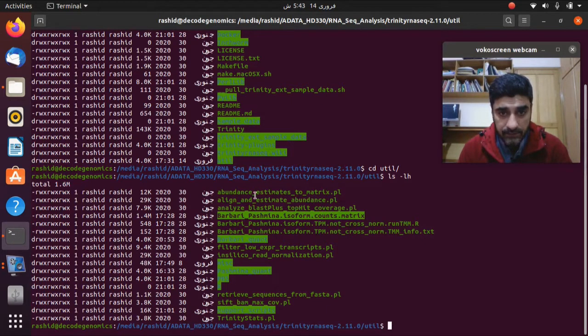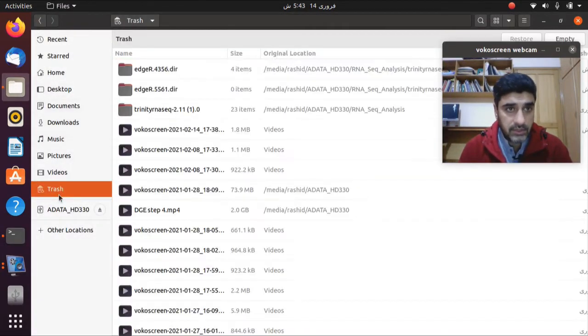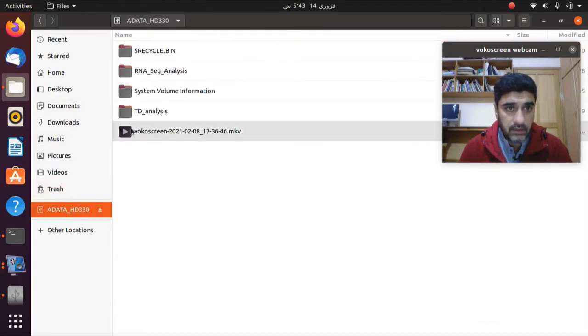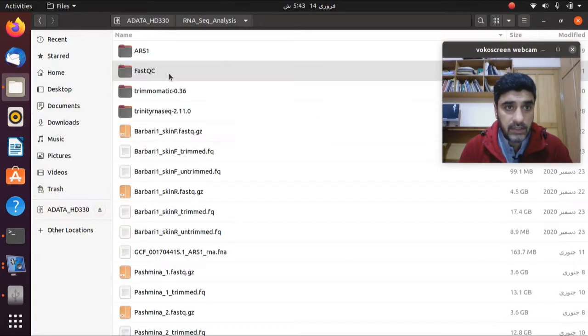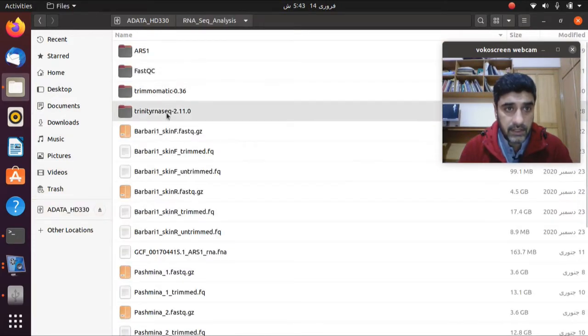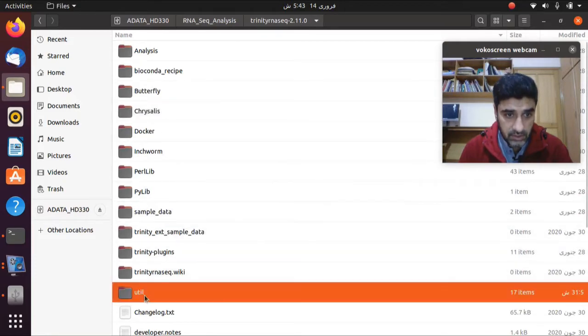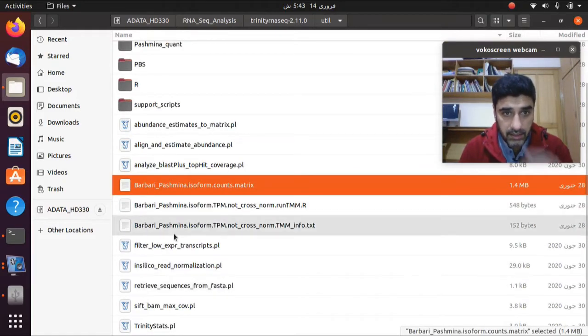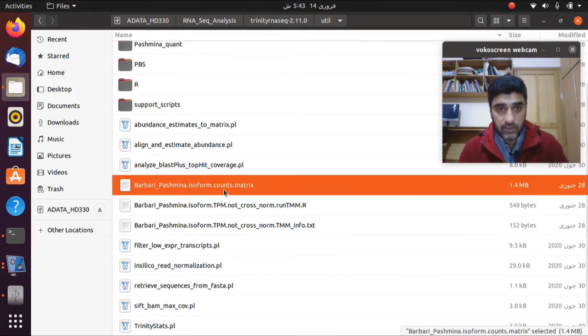So go into the folder section, into the trash bin. Okay, no, sorry, in our hard drive. So here we are, then we are in Trinity, then in Trinity there is a util, and here is the file, this file we want to move.